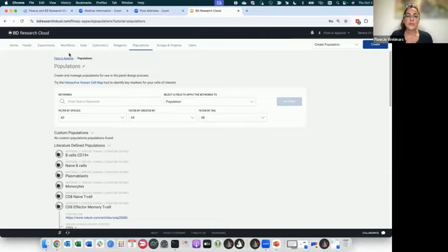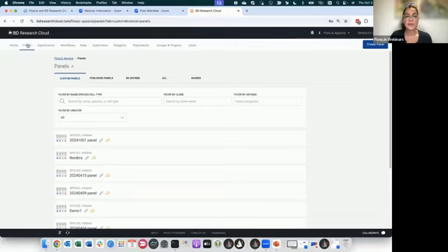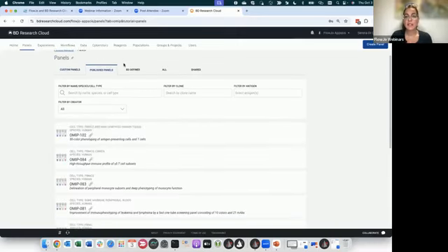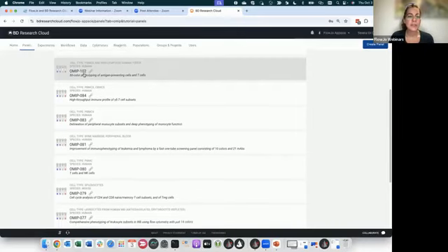What this population will do later on, whenever you design a panel, is this: you go onto the panel section, and you will be prompted with published panels. So you can find all the different panels that are published. The latest one is the OMIP panel with 50 colors. So that's really a lot of information that you can include in a panel.